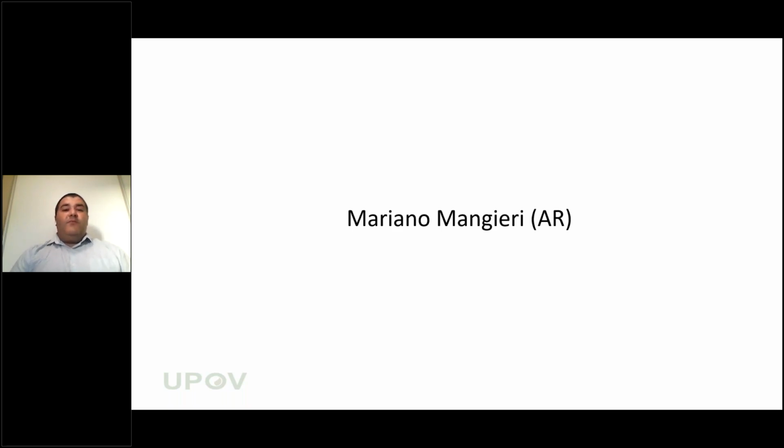Regarding the method, we used 858 soybean varieties from different breeding programs. DNA was extracted and samples were sent to an external genotyping service provider for genotyping with the SoySNP6K, a subset chip of the Illumina Infinium BeadChip SoySNP50K.